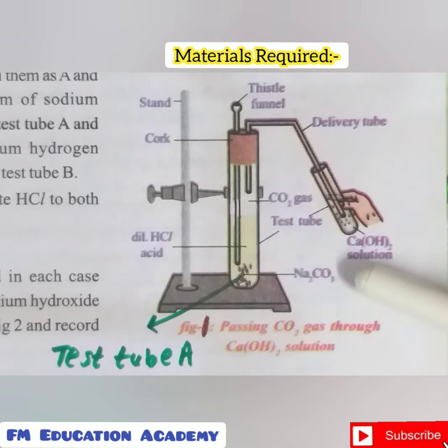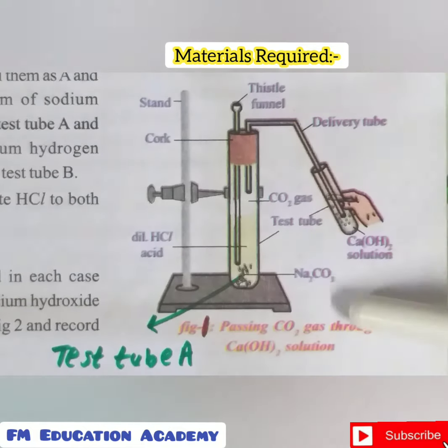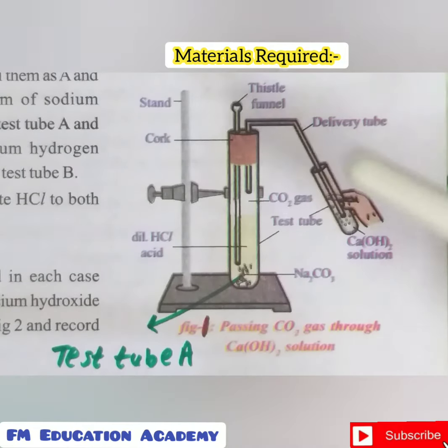Carbon dioxide is being shown here because when sodium carbonate reacts with hydrochloric acid, carbon dioxide gas is released. So we don't need carbon dioxide gas initially. We need HCl and sodium carbonate. When they both react, they will produce carbon dioxide gas. Now let us concentrate on the procedure.